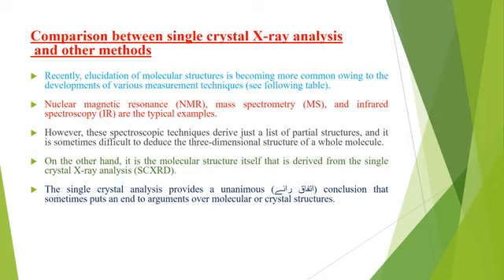On the other hand, when we use the X-ray diffraction technique, it is the molecular structure itself that is derived from the single crystal X-ray analysis. The single crystal analysis provides an unambiguous conclusion that sometimes puts an end to argument over molecular or crystal structure.